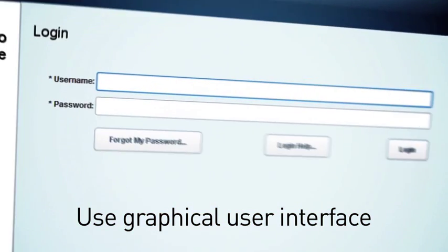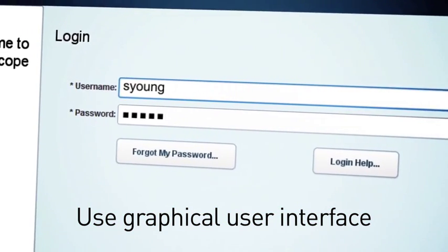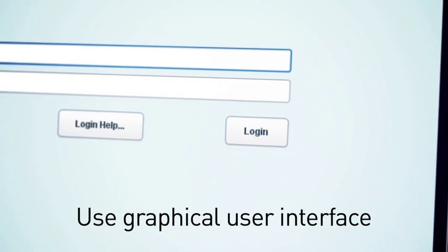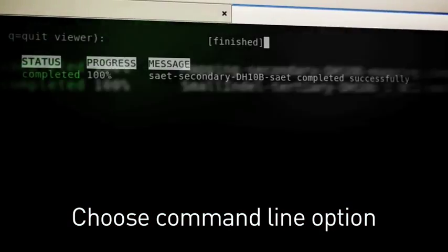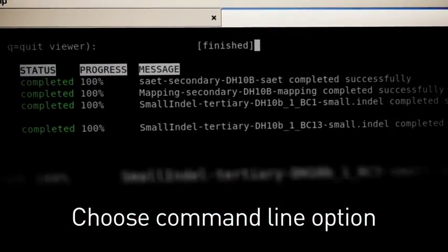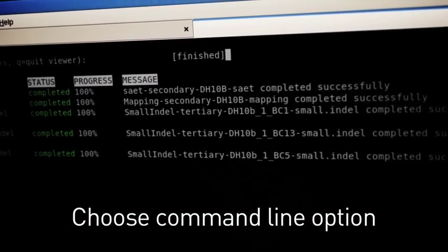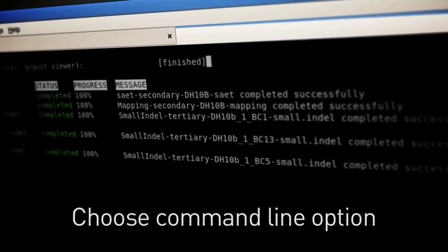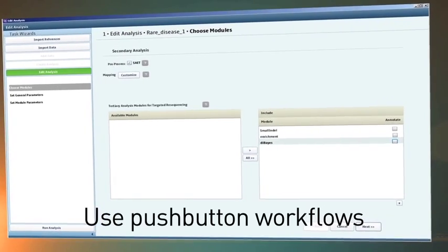LifeScope offers you the choice of an intuitive, easy-to-use graphical user interface or a powerful collection of command line options to explore and evaluate different analysis pipelines.